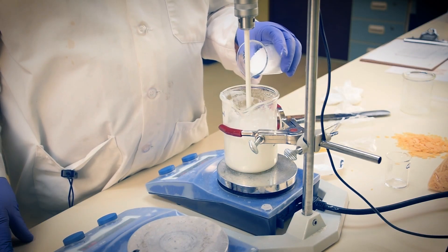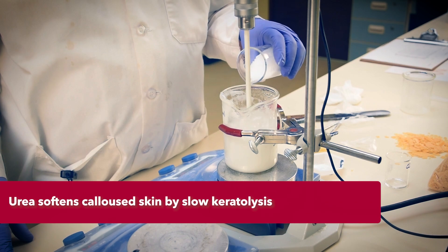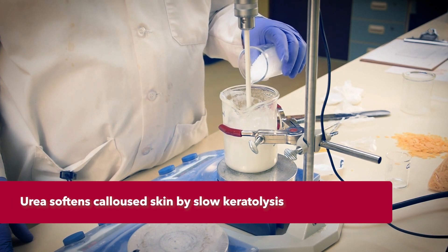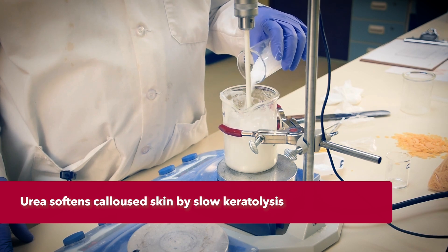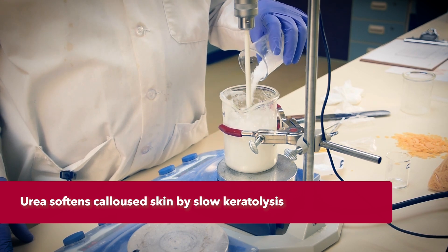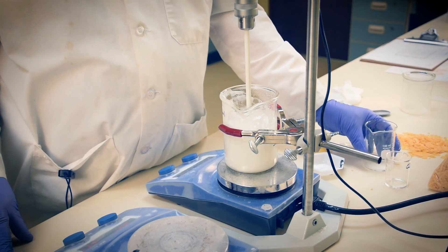The batch is now at 55 to 60 degrees Celsius. We'll first add the key element for foot care: urea. When urea dissolves in water, it does so endothermically. So adding 15% urea will cool our batch down 10 to 15 degrees Celsius all by itself. Cool, huh? Pun intended.